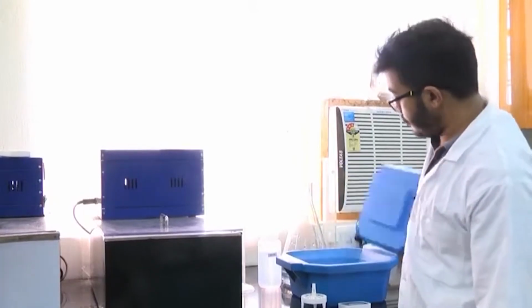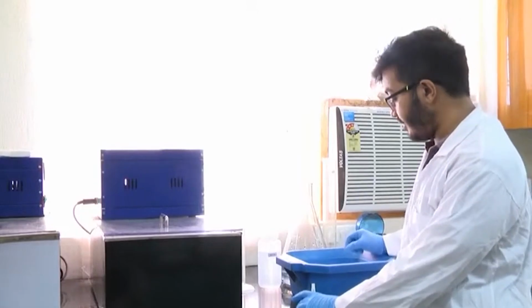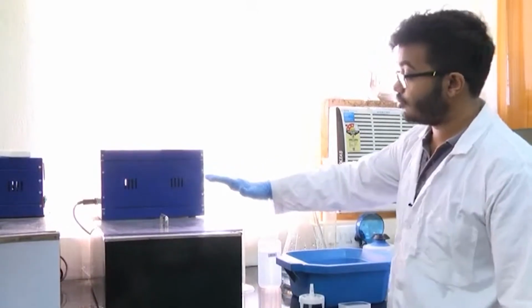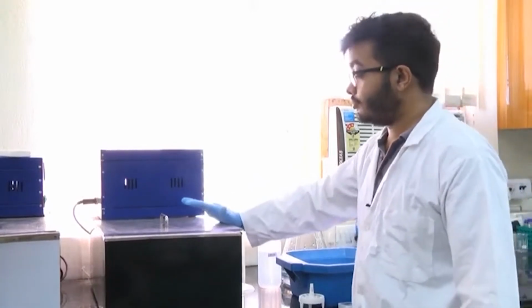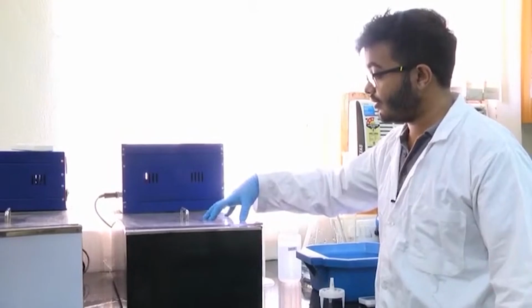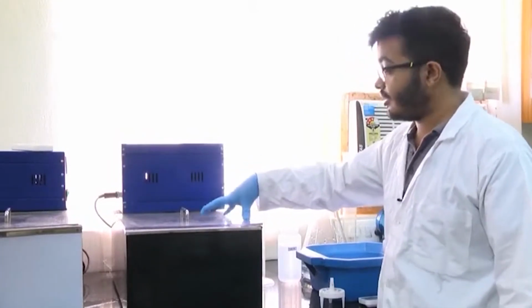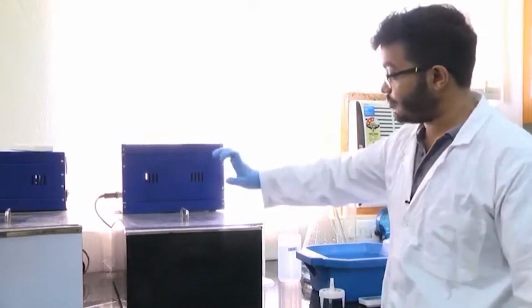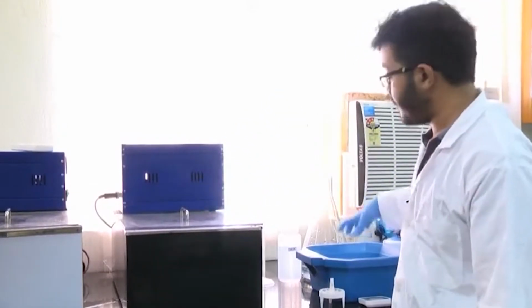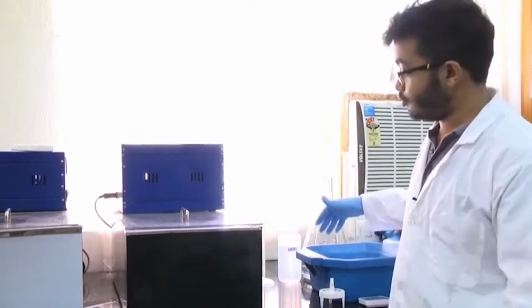Next, we are going to take out our vial containing the DNA mixed with the competent cells, and move on to the step of heat shock. This instrument that we have here is a water bath, which is being maintained at 42 degrees centigrade. I will take the vial, keep it here for 45 seconds, and once it is done, I will take it out and put it back in ice to let the cells recover for 2 to 5 minutes.